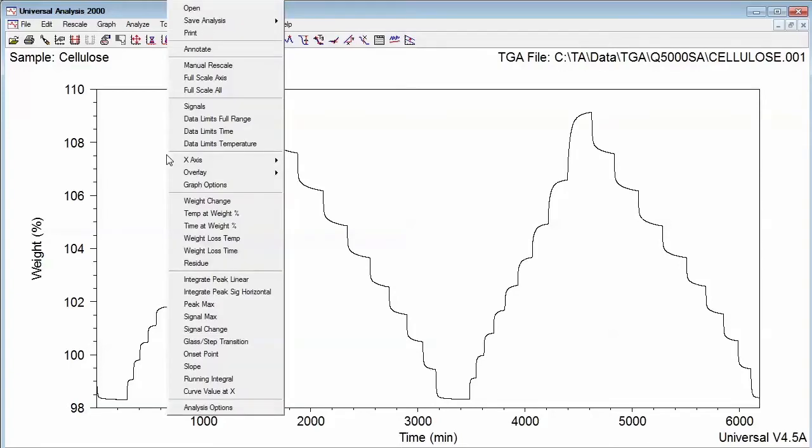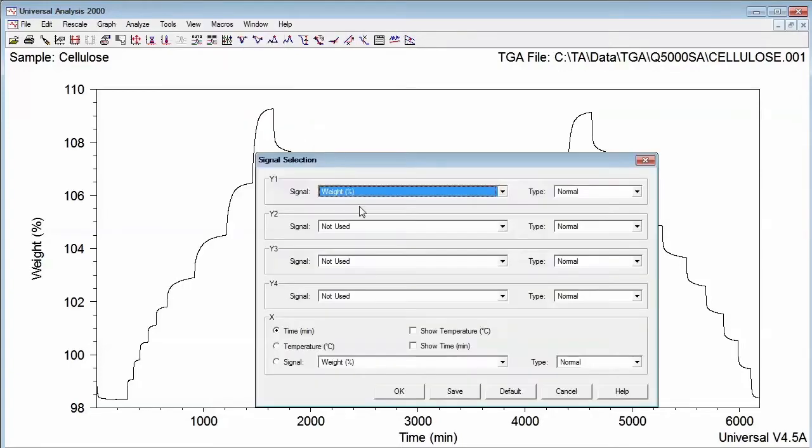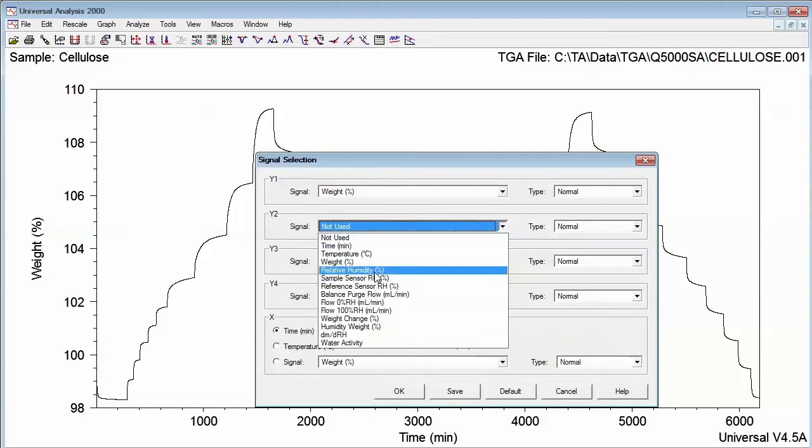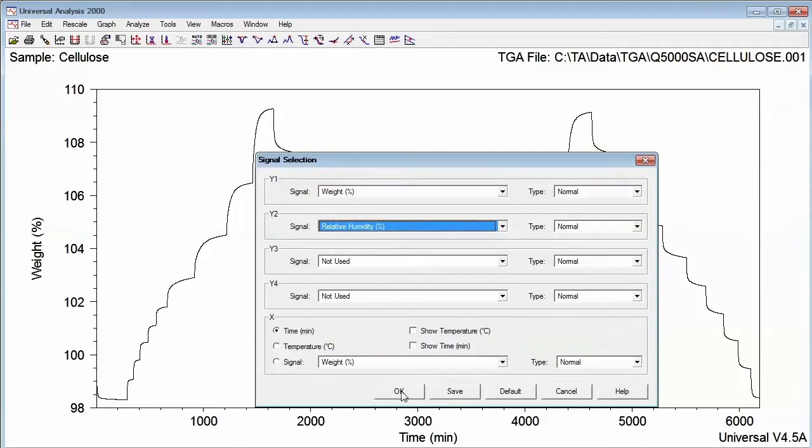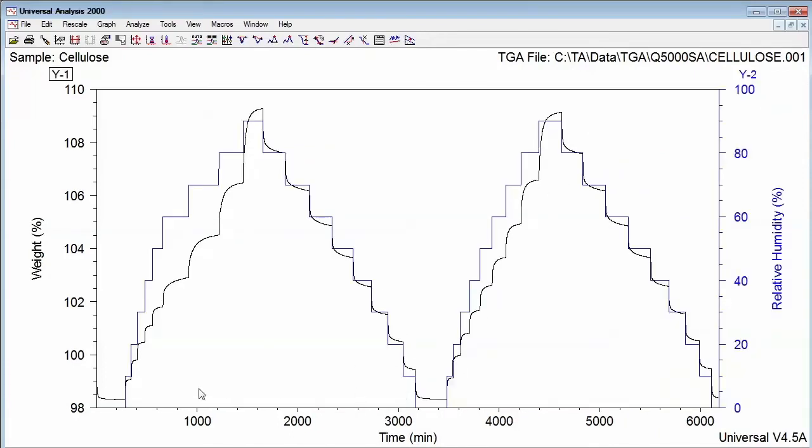I can also right-click, select signals, and add relative humidity as a signal to the plot. Here you can see that RH has been stepped incrementally from 0% RH to 90% RH, and two sorption and two desorption steps have been performed.